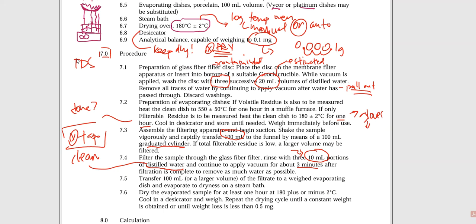This should not be an issue if you've been around in a lab for a while because it's like, use deionized water, use deionized water, use deionized water. Okay, well, deionized water we just kind of deal with. We don't have a proper distillery in the lab at this moment. But at the same time, folks, we do have an ultra pure water system that is arriving at any point in time.